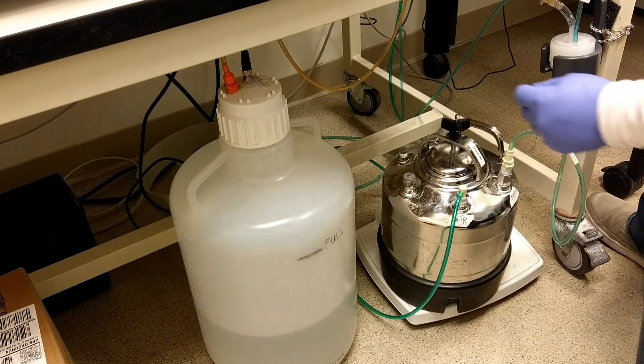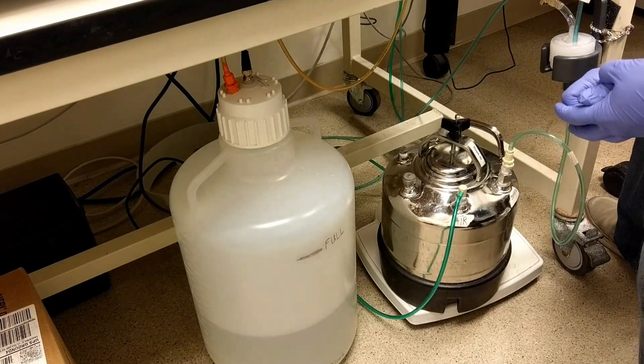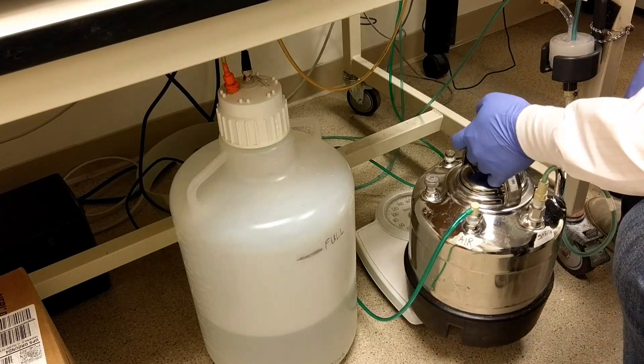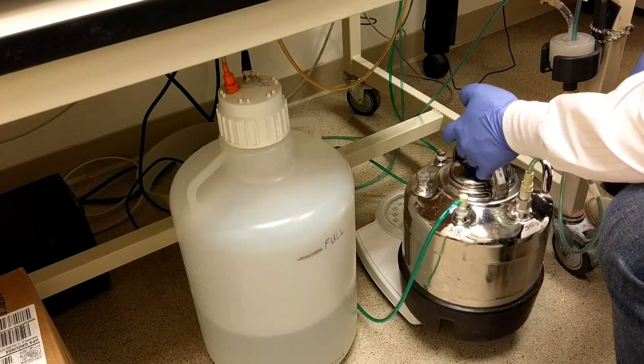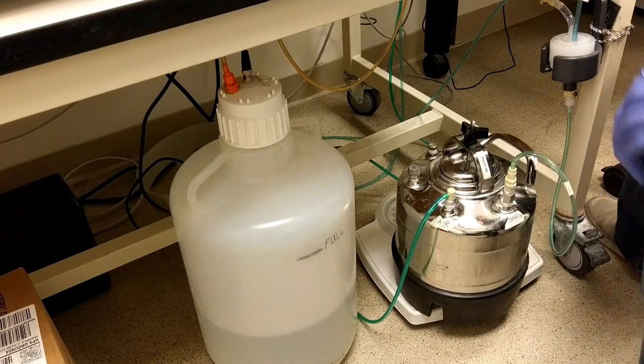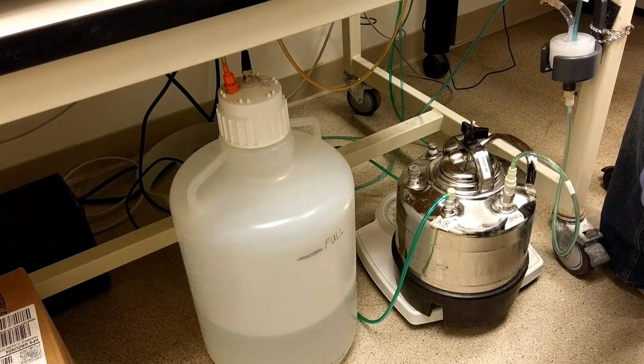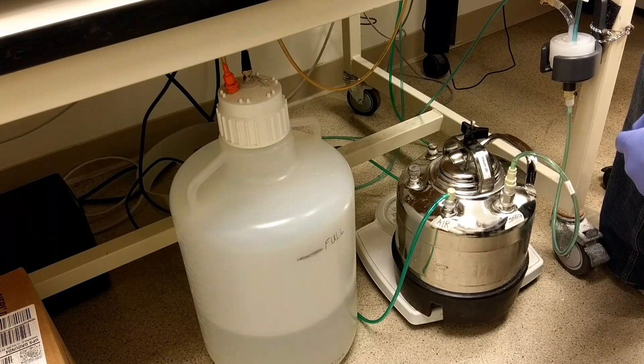We have it on a scale that's zeroed out to an empty sheath tank and it should read about 15 to 16 pounds when full and zero when empty. So it's a good idea to check the scale when you get on the instrument to make sure you have enough sheath for your run.